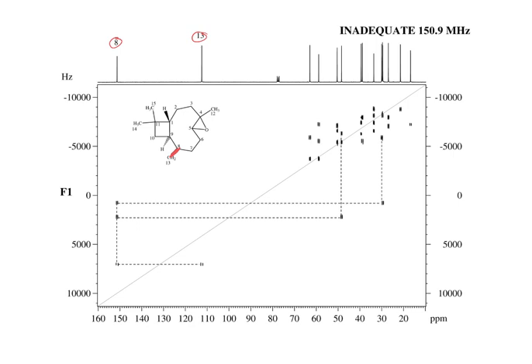So they kind of stand out from everything else. From 55 to 70? No, the quaternary one is at like 150, and the terminal one is about... Based on this table. Oh, the coupling constant?